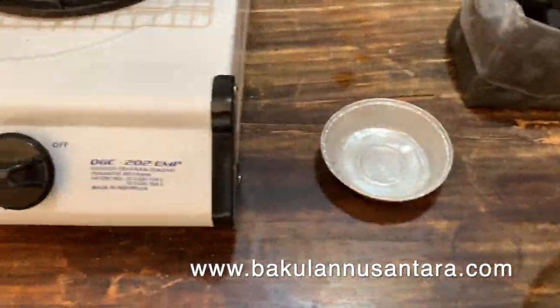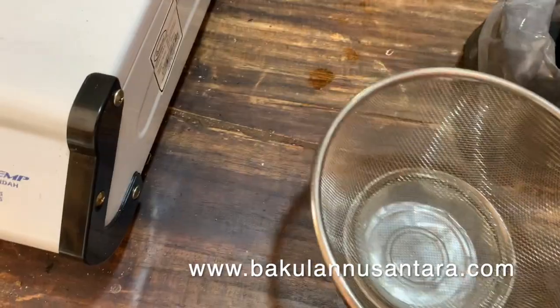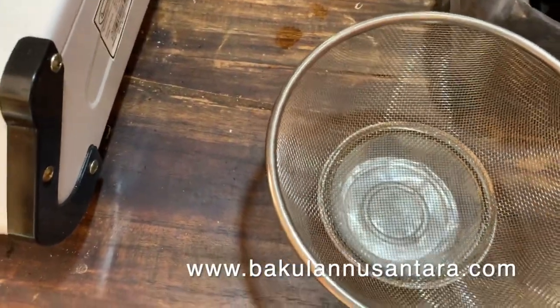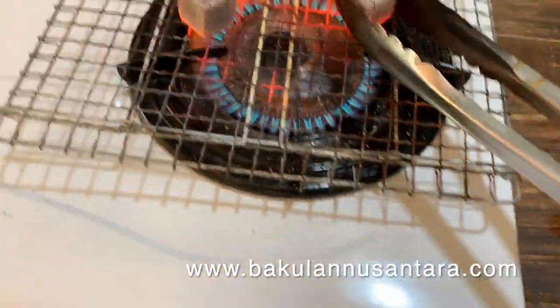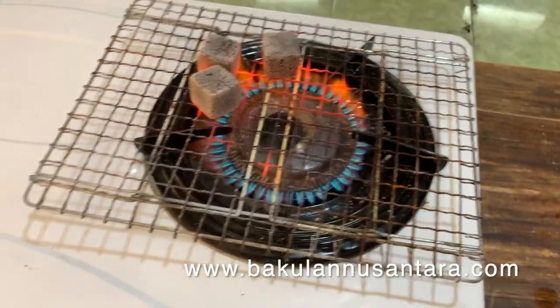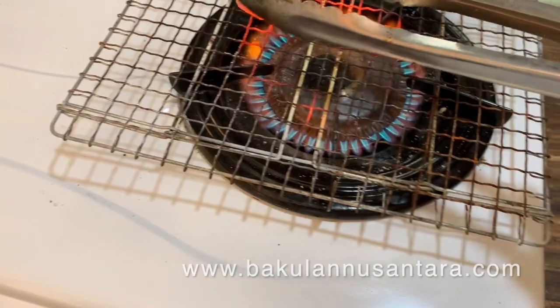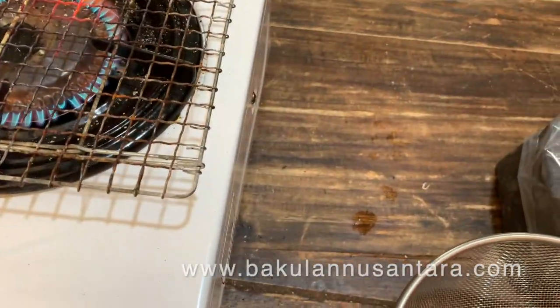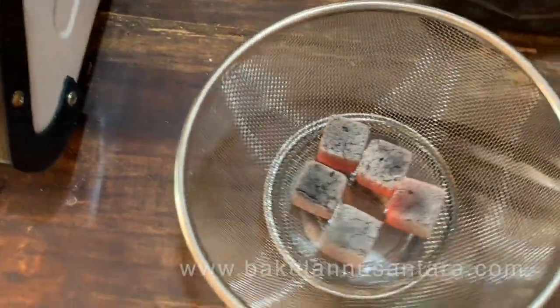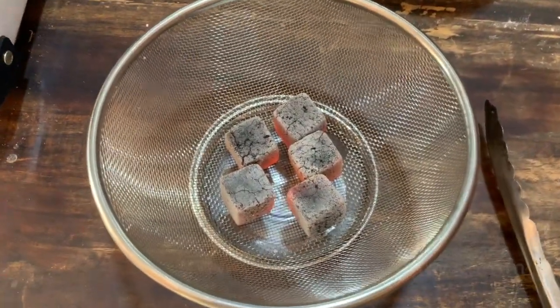So now I'm going to put the briquettes in a sieve that will let the ash fall through, and we'll burn them for between two to two and a half hours. We'll just leave them to burn through and collect the ash at the end.